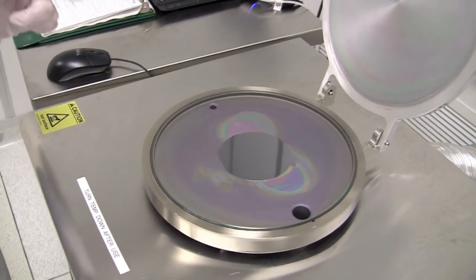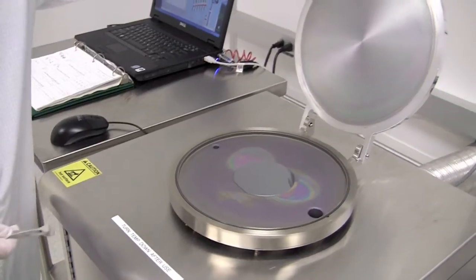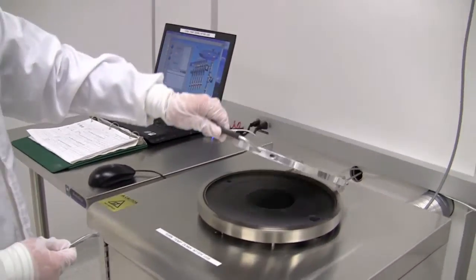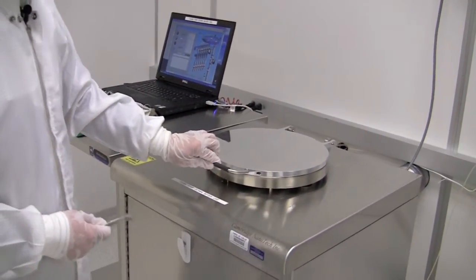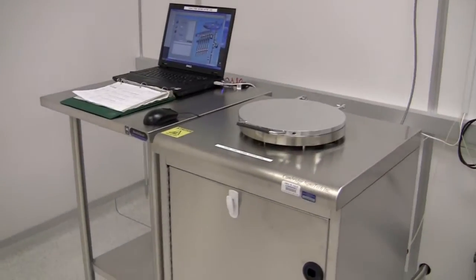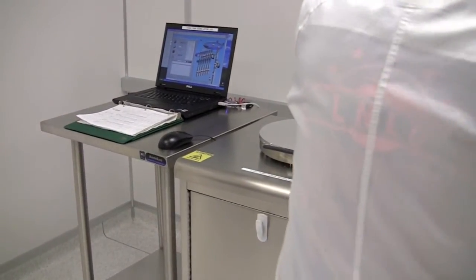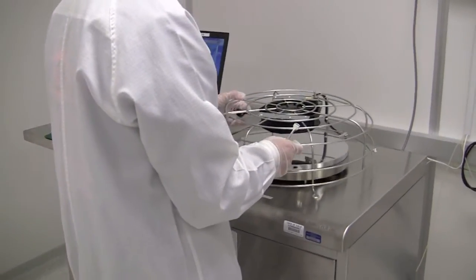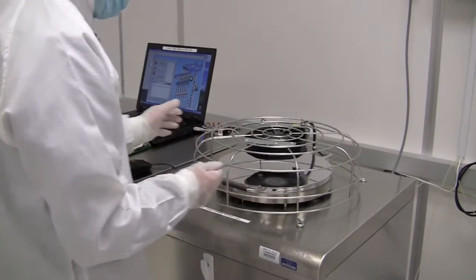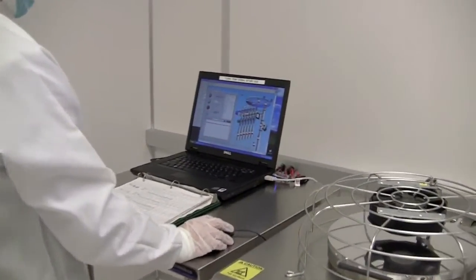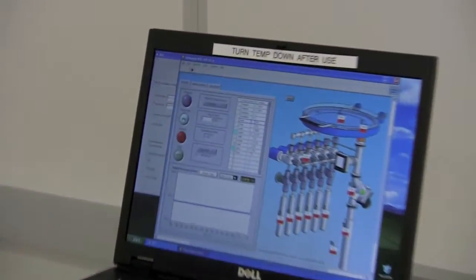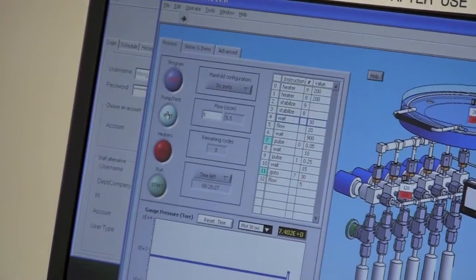Be very careful, the chamber is extremely hot. Close the lid and put back the metal shield. Now click the pump button to pump down the chamber pressure.